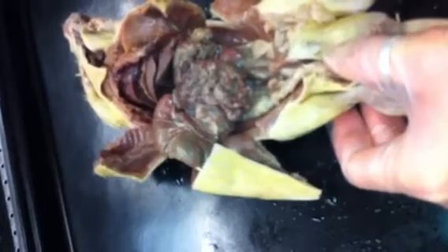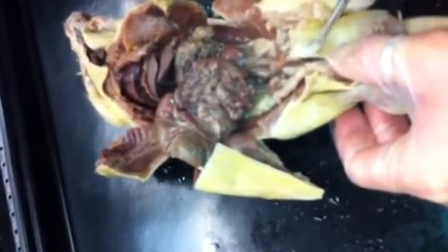The penis is right here. And so remember we talked about them having the sheathed penis, so it's actually not really visible. We just see the area where the penis is located right there. And then, we didn't go over the thoracic cavity yet, did we? Okay. So then if we go back anteriorly or towards the head, we look back for the diaphragm.